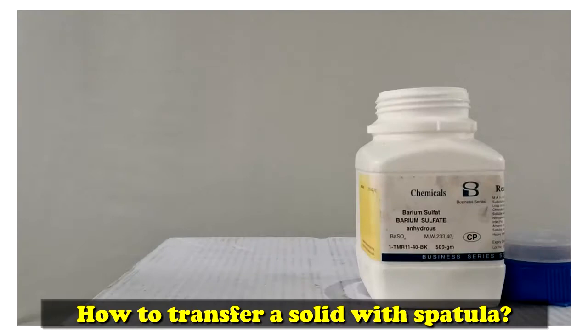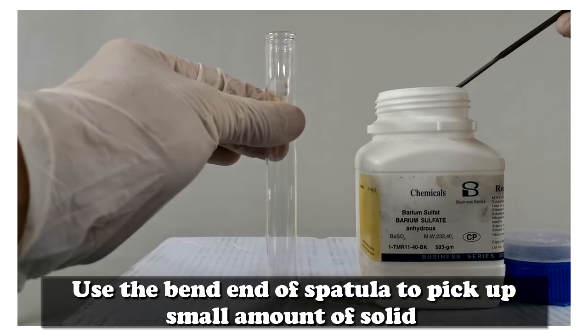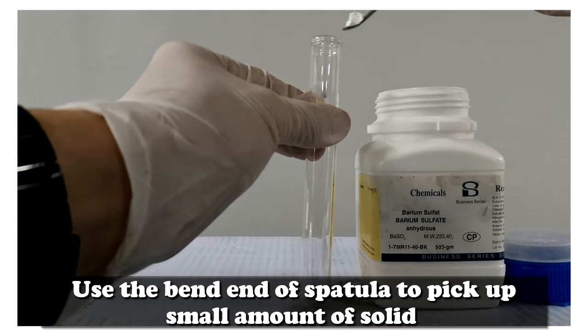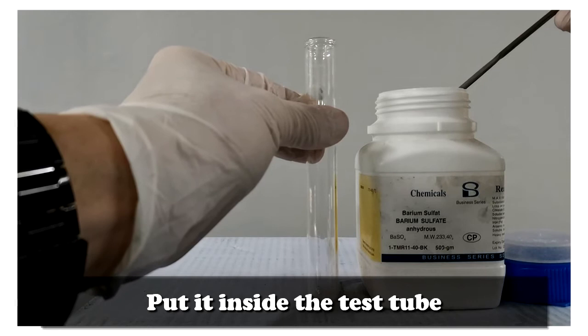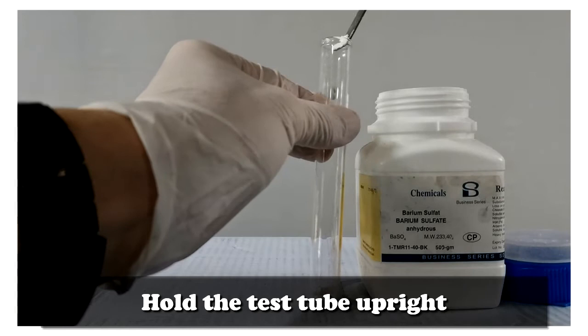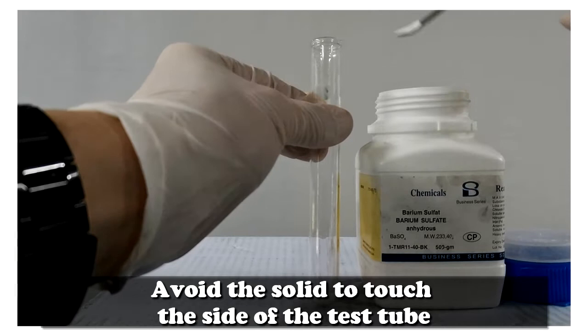How to transfer a solid with spatula? Use the bent end of spatula to pick up small amount of solid, then put it inside the test tube. Hold the test tube upright. Avoid the solid touching the side of the test tube.